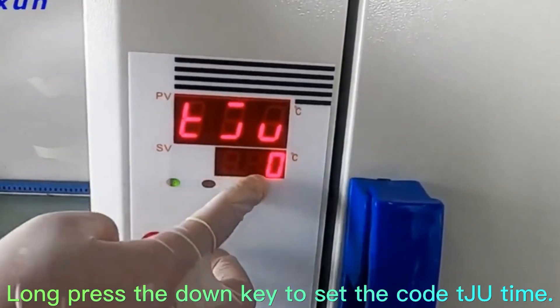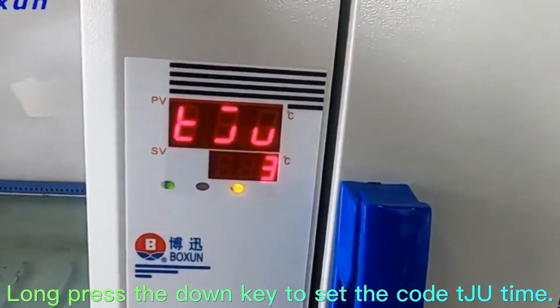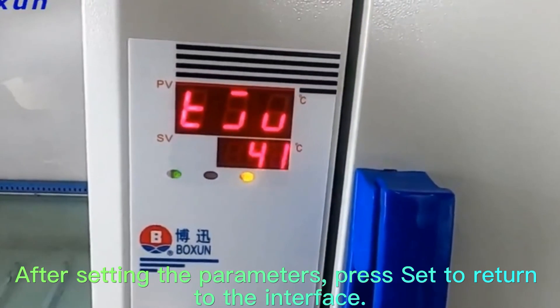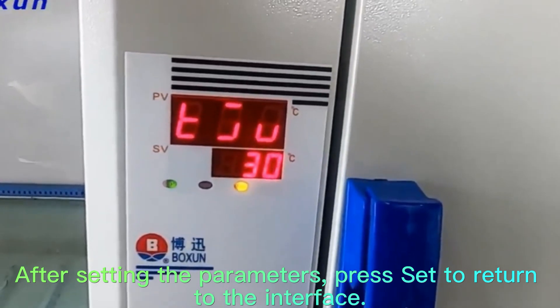Long press the Down key to set the code TJU time. After setting the parameters, press Set to return to the interface.